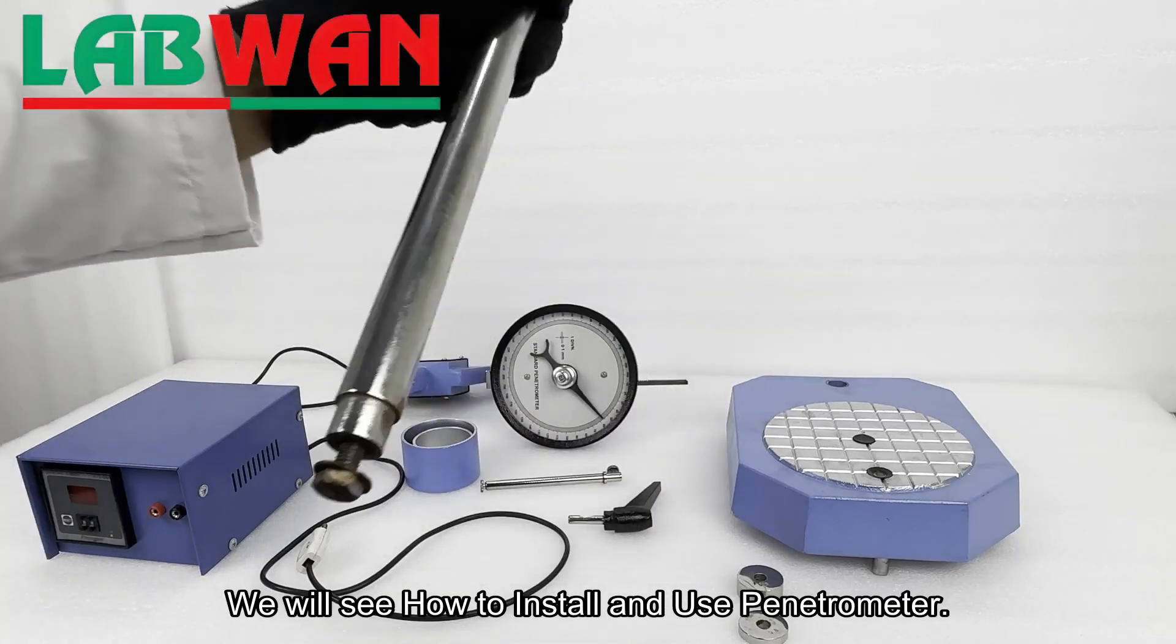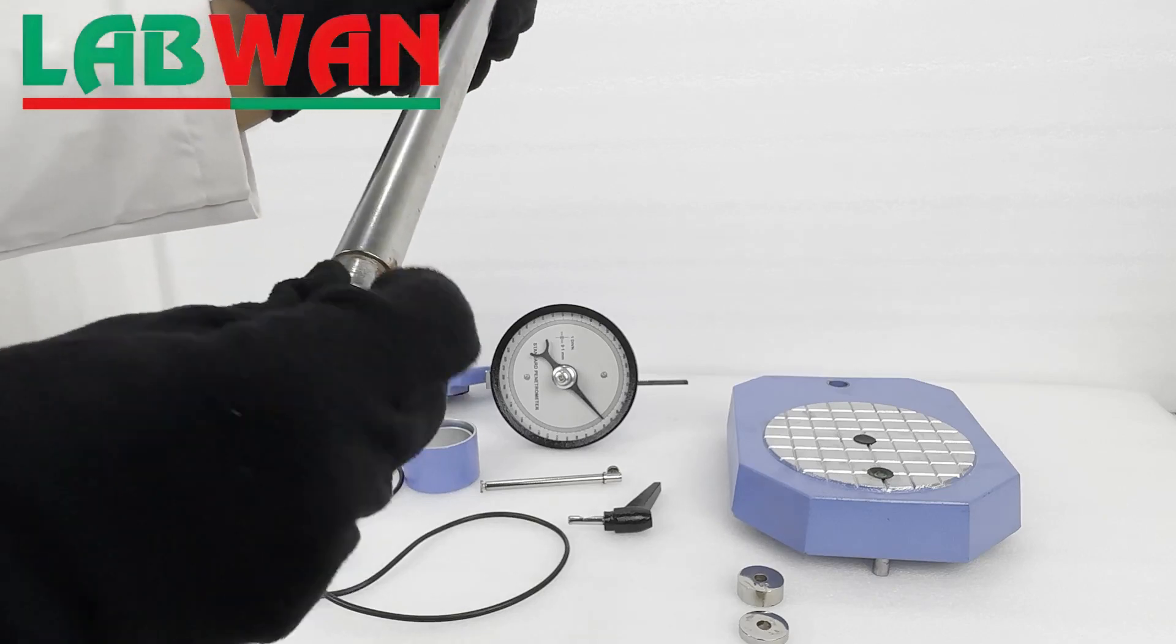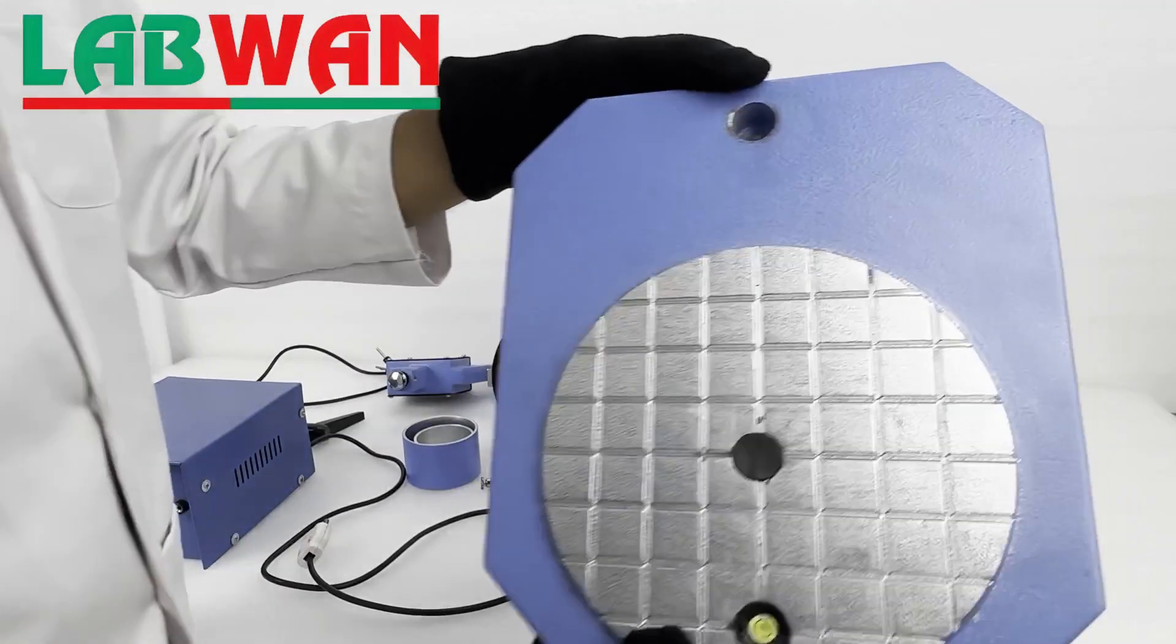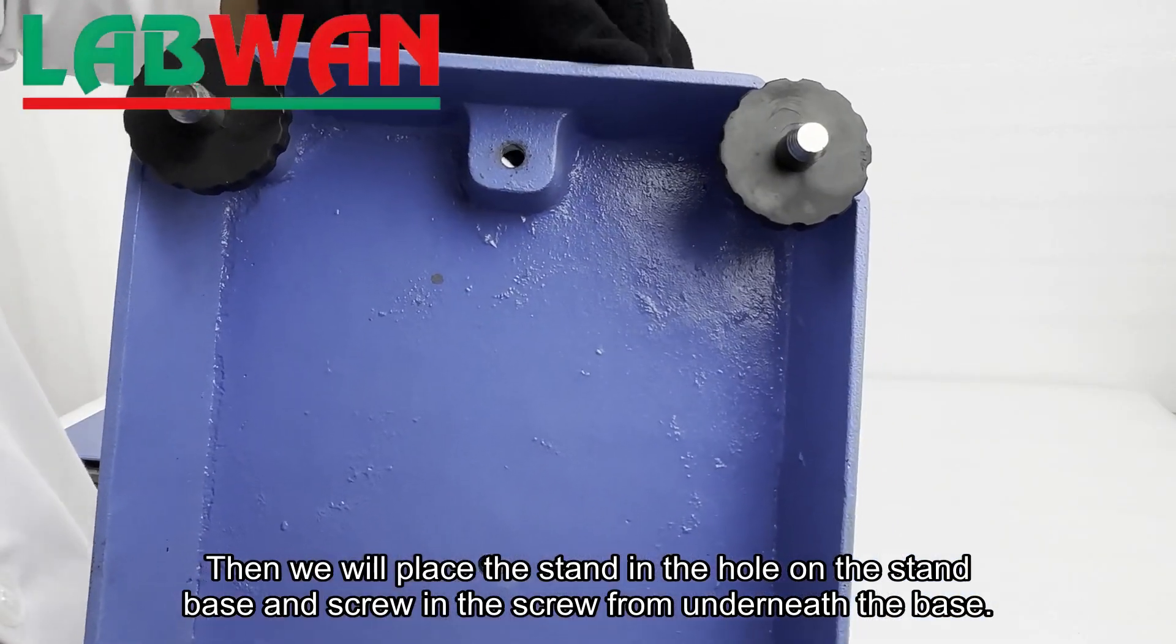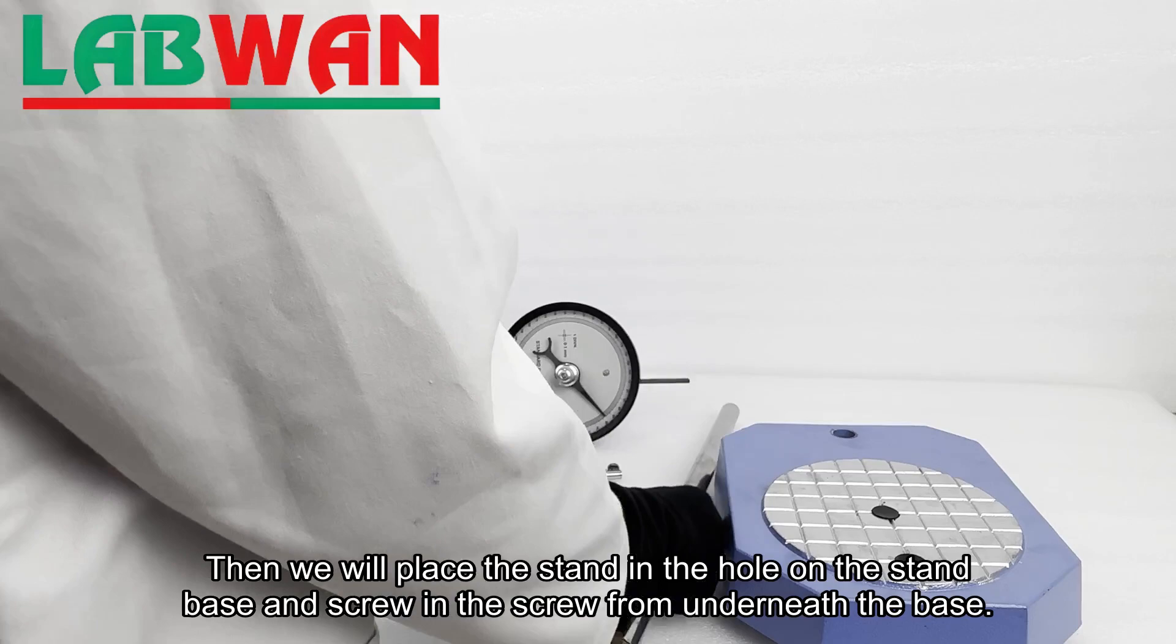We will see how to install and use a penetrometer. First, we will take the screw out of the stand. Then we will place the stand in the hole on the stand base and screw in the screw from underneath the base.